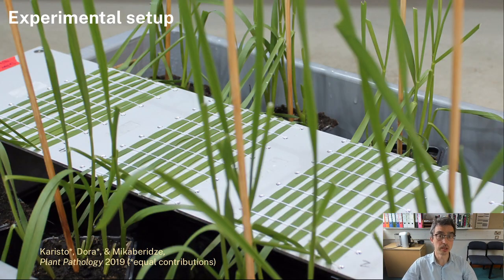So we devised this original experimental setup in a glasshouse under controlled environmental conditions, where we had those metal plates on which we attached those leaves with elastic strings. These were second leaves of young wheat seedlings.